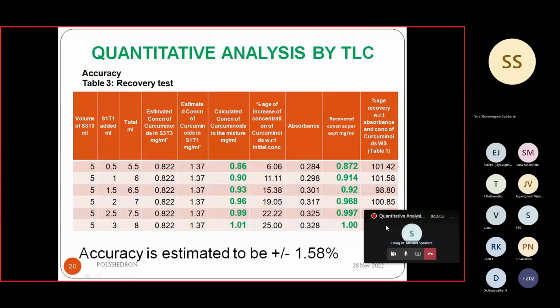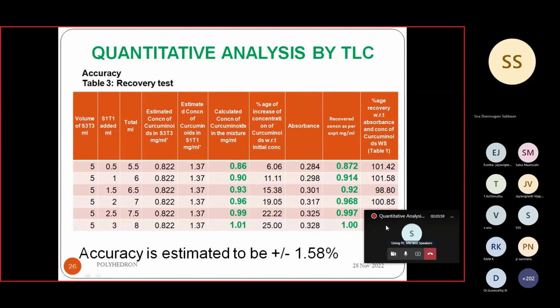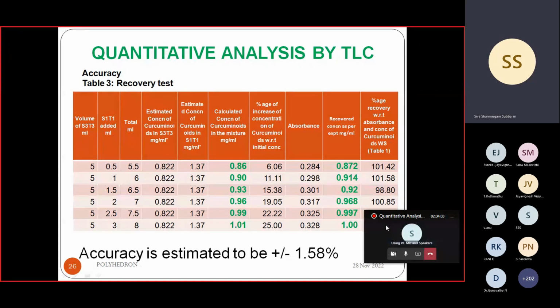Okay, and the accuracy of that system is fairly good. Accurate. Everywhere, even in GC, we are using that. But it requires some expertise. In GC, to avoid the error, normally we use an internal standard, which is not possible in TLC, but still we need accuracy here. In GC, the error will be very high if you don't inject properly, because the injector port will have a very high temperature, say 200 degrees centigrade, whereas this is room temperature and the error will not be there. But with experience, one can do it without any problem. I've done it many times, and my laboratory is using this principle.